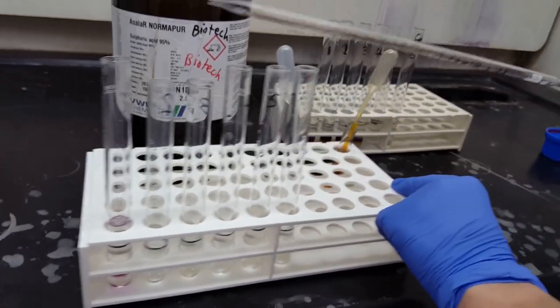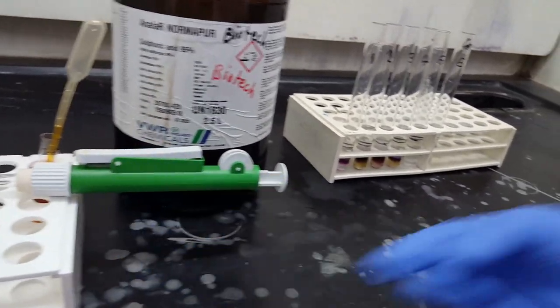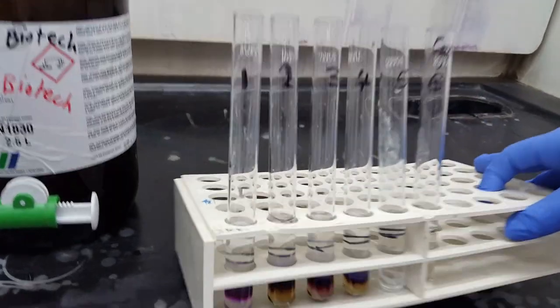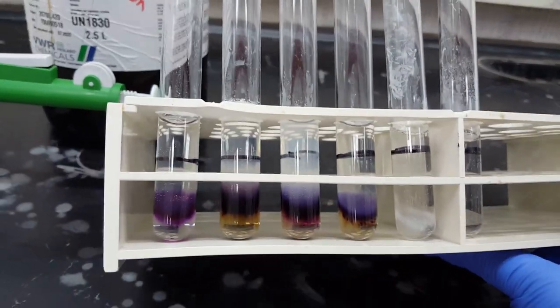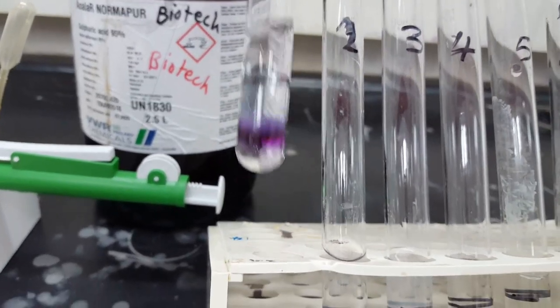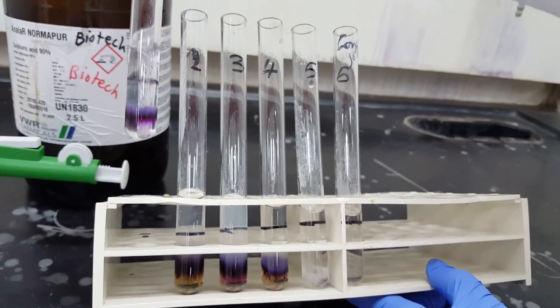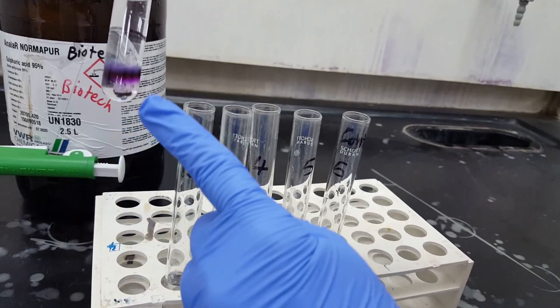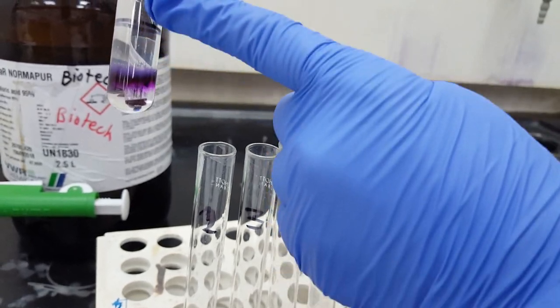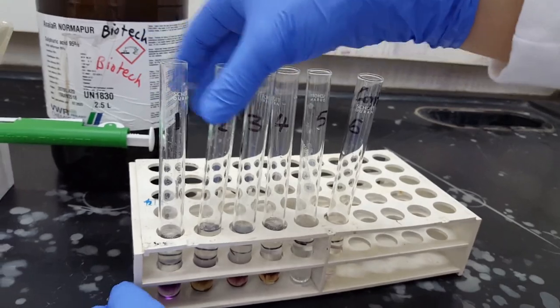If I add the concentrated sulfuric acid to the rest of the test tubes, how are the tubes going to look? Just watch here. So here is the result. Can you see the interface here? This is the first test tube, which has the glucose. As you can see, there's an interface with the sulfuric acid. It forms a purple ring here. Down, we have the concentrated sulfuric acid. At the top, we have the aqueous solution. This is the chemical reaction which takes place over here.